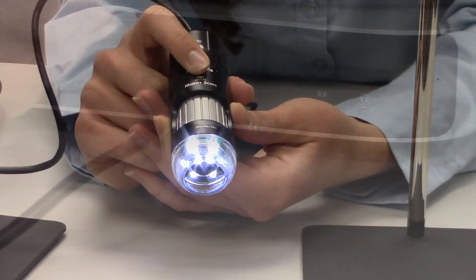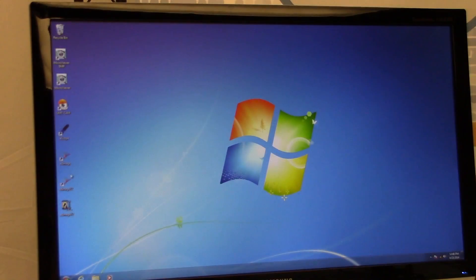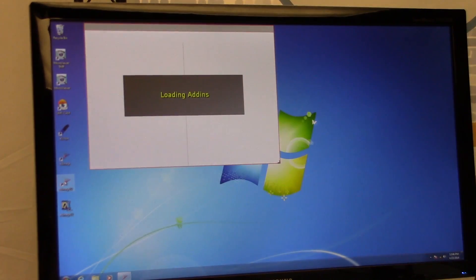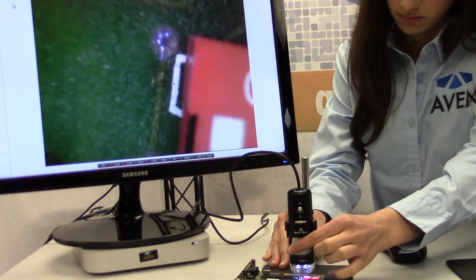To use, simply plug in the unit into the USB port and open the software that comes with the scope. The magnification works by focal distance, so the closer the scope is to the object being viewed, the higher the magnification. Once you are at your desired magnification, simply adjust the fine focus until your image is clear on the monitor.